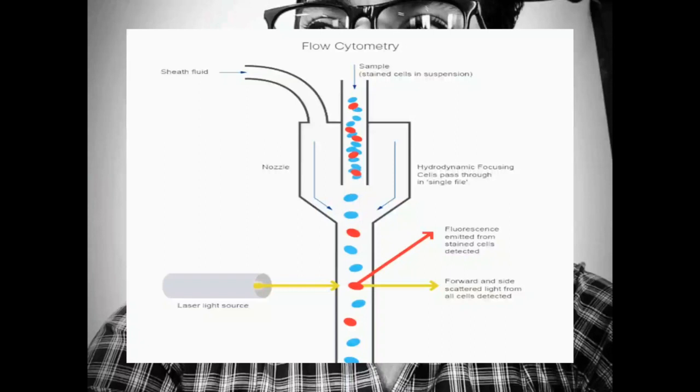The fluorescence can then be emitted after collision with the light source beam, and it is detected by the different dichroic mirrors, and the internal cell structure or cytosolic structure can be determined.